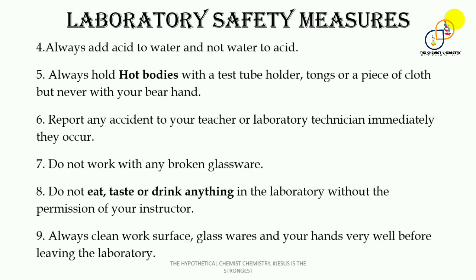Sixth point, report any accident to your teacher or laboratory technician immediately they occur. Don't try to fix things secretly. That might result in your danger. So please always make sure that you report any accident to the laboratory technician or your teacher immediately they occur.